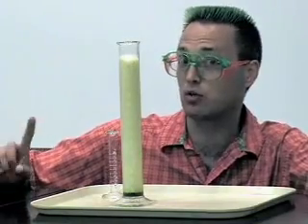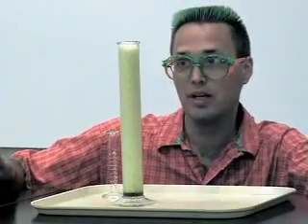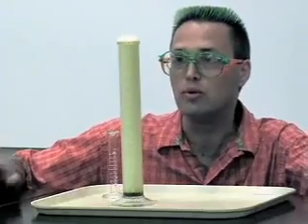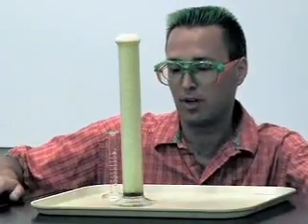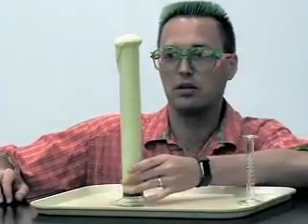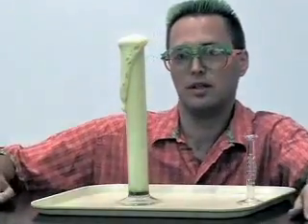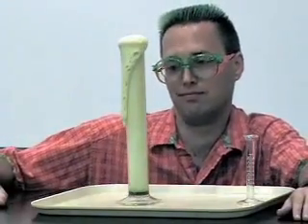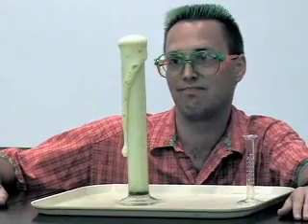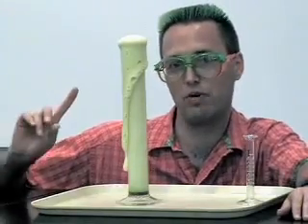And remember, this is 3% hydrogen peroxide. It's still foaming, and it's going to make a mess now. There it goes. Ooh. Classic. Maybe I'll go, oh here, look. You can see it foaming over the side, huh? Beautiful. 3% now. Still going. So this is a reaction rate, right?